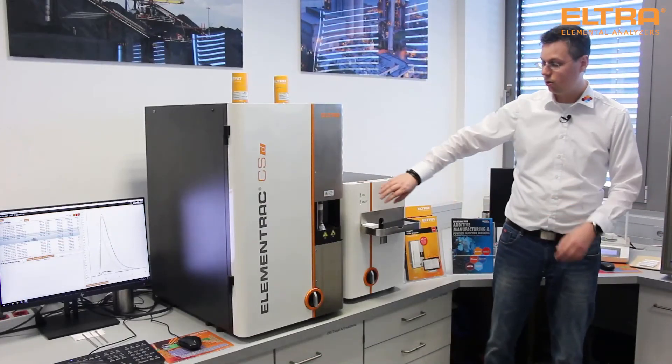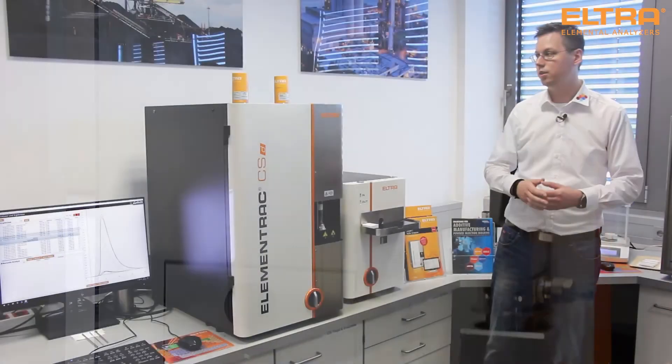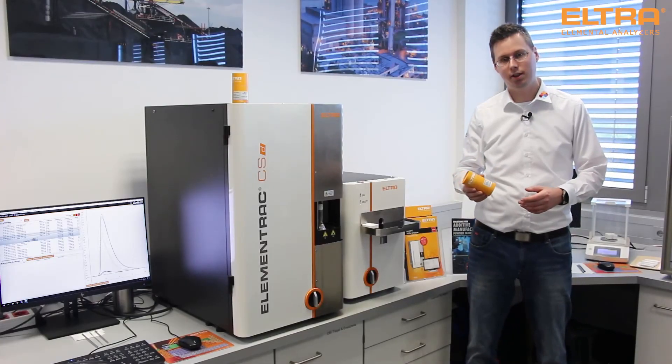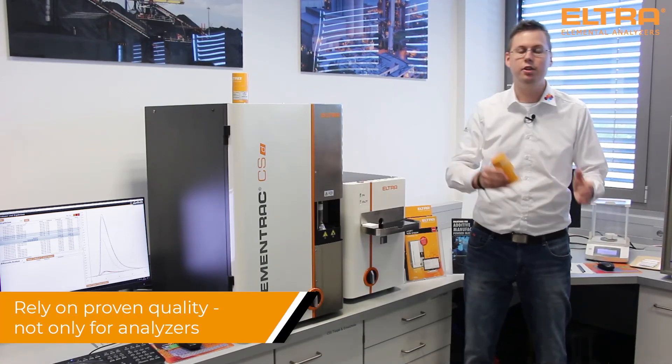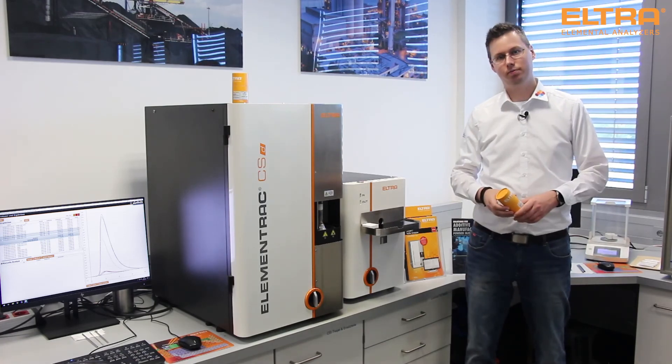But for a good analysis you don't only need an excellent analyzer — you also need high quality consumables and standards. So here at Eltra we put our energy into every detail to optimize your and our results. Thank you.